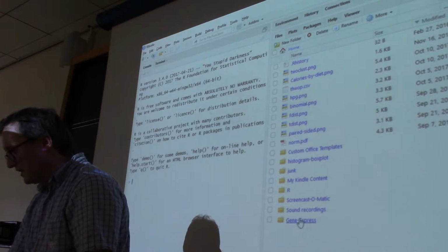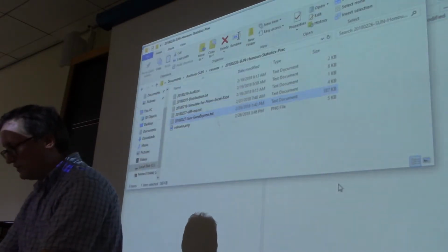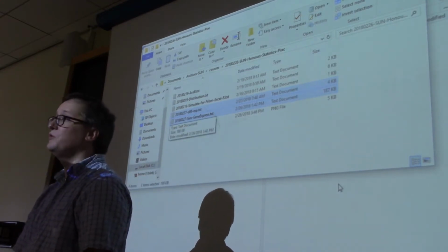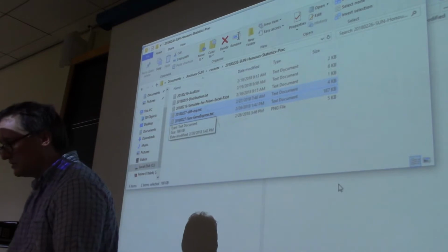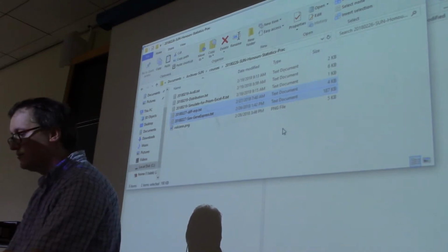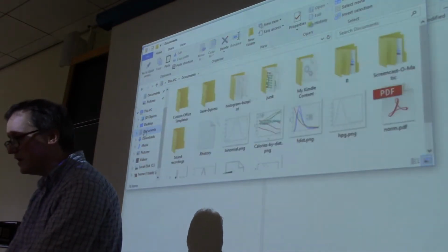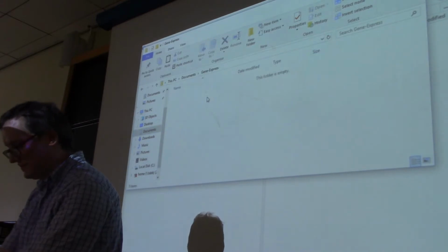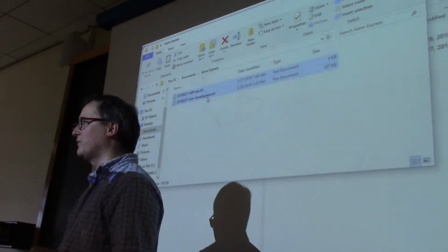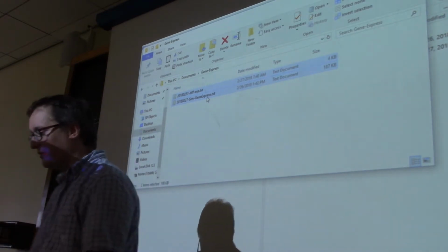All right, so we open that directory. We see that it's empty. Now we're going to add these two files to it. Now mine looks very slightly different than yours because I've added some code this morning, but we're going to just let that be how it is. So I'm going to copy diff expression and sim gene express into this directory, which is located in documents, gene express. If you're doing this on a Mac, you're going to have different locations for some of these things, but you can create whatever directory in whatever place you want for it. That's all going to be fine.